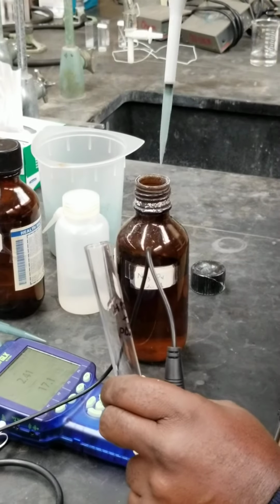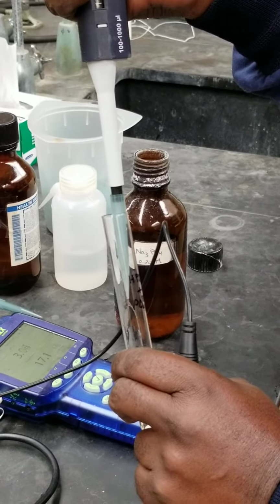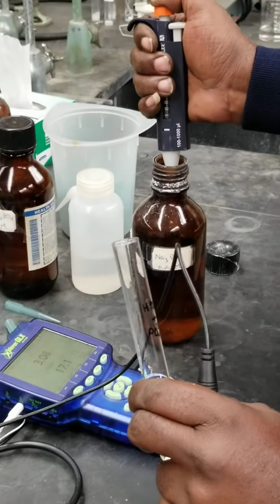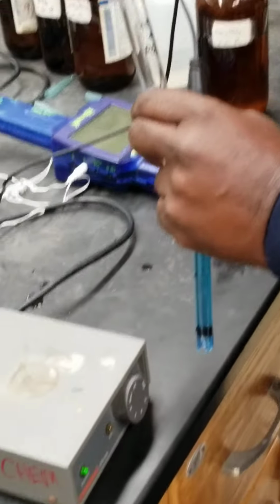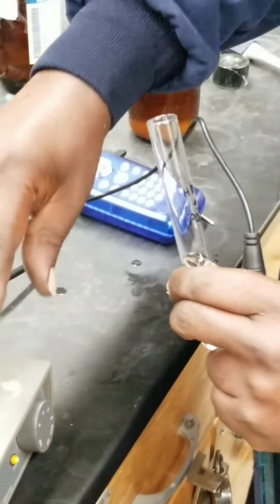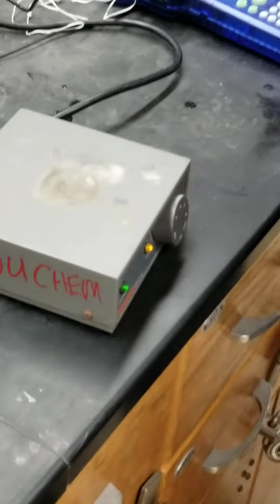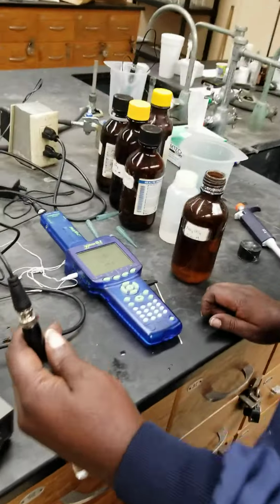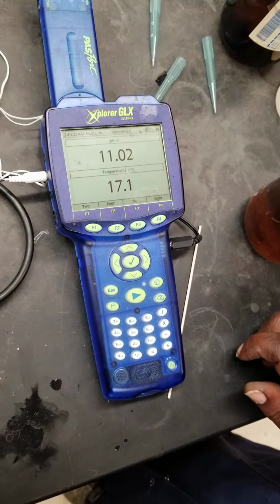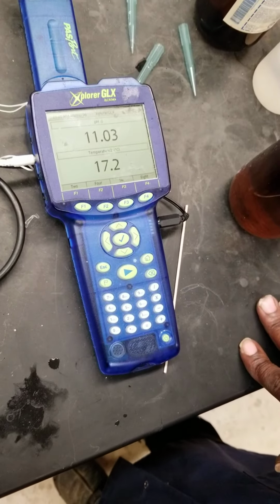One. Two. Three. pH is 11. Let's read that as 11.02. 11.03, 11.02, whichever one you like. Okay, 11.03.